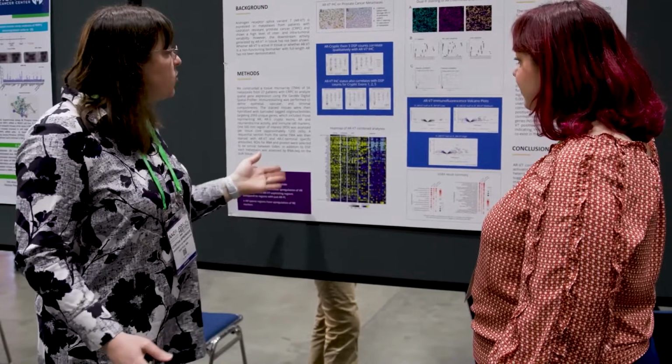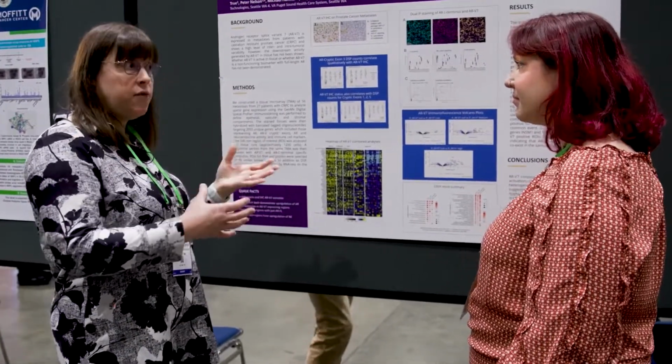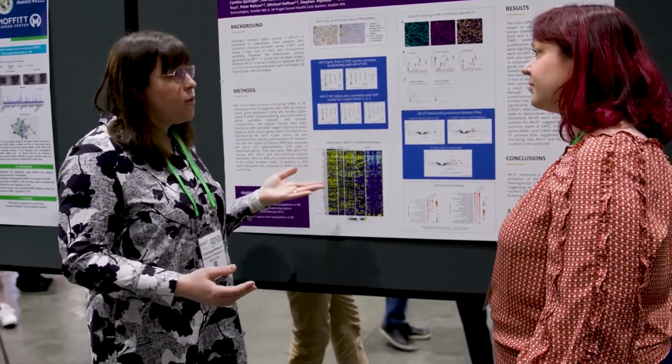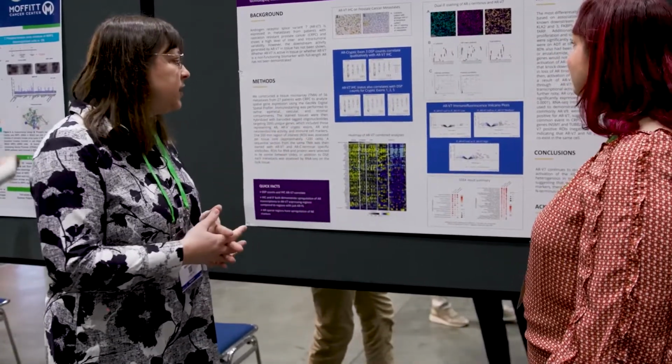And so then when we looked at the transcriptome in those regions that had, say, high levels of V7 staining versus low levels, what we saw was this upregulation of AR-regulated genes, which is great because it's AR-V7, so we would expect to see that.